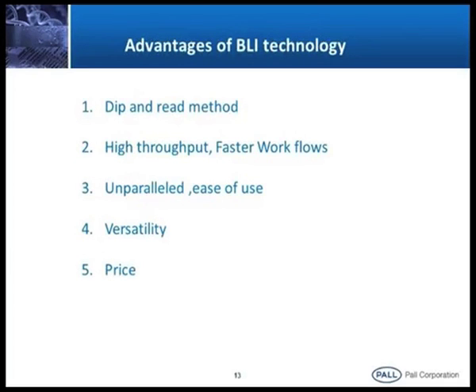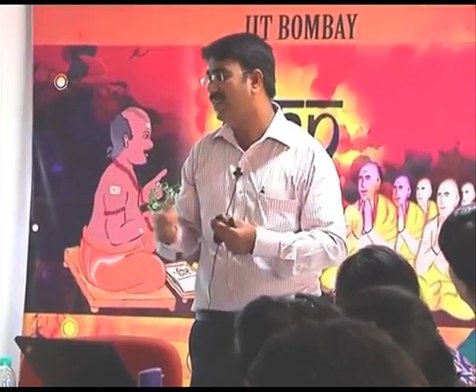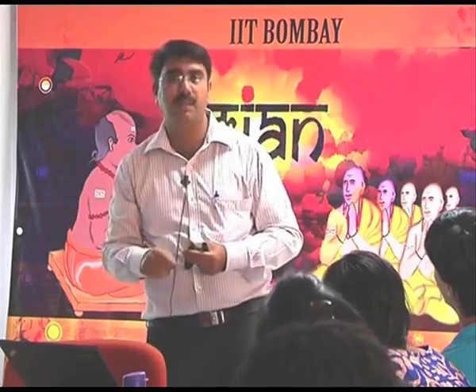In case of SPR, it works on the principle of microfluidics. You know in HPLC there are pumps, peristaltic pumps, which deliver the mobile phases. In SPR also, there are buffer systems which deliver the mobile phase or the buffers on the sensor surface. So in microfluidic devices, we can't use crude samples. Suppose you want to do a serum sample analysis, or body fluids, or samples from the bioreactor itself, because they contain so many contaminants, it blocks the flow cell. Once it blocks the flow cell, we have to replace the complete assembly. That is what is expensive in case of SPR microfluidic devices.